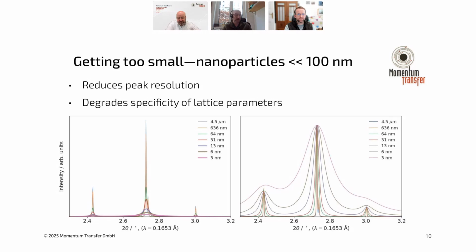And when you get into that kind of sub 10 nanometer, this is where distinct identification of crystalline phases and reciprocal space becomes very difficult. And so that's also not the target application for the database type methods, although it can work for simple structures. And actually, I think in a few weeks, we'll do a session also on what are the options for materials identification in those cases with nanoparticles and even amorphous materials.